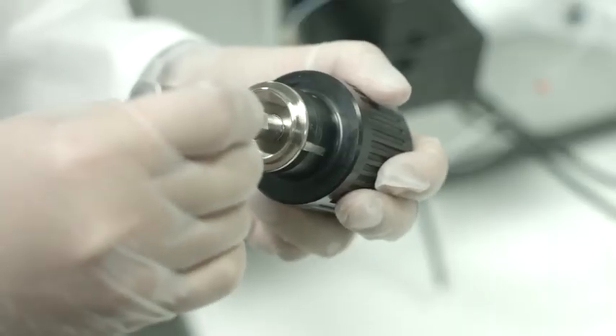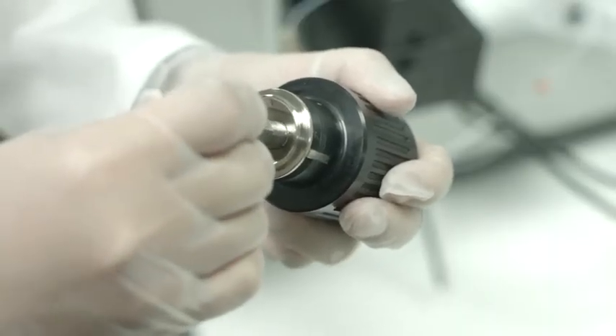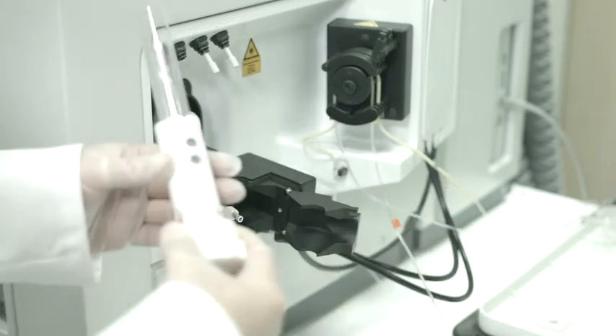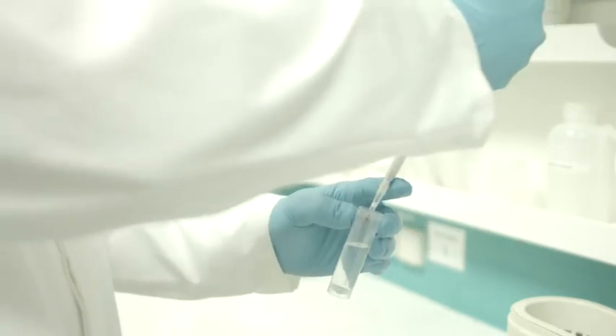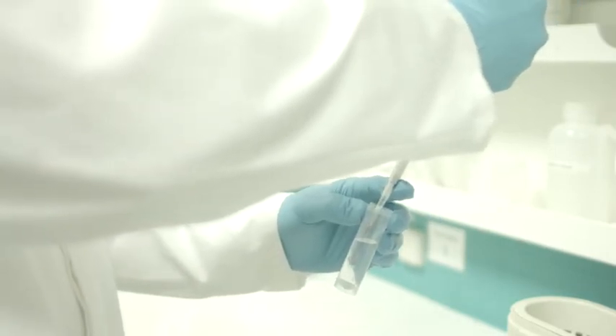One of the limiting factors for ICP-MS is often the ability to tolerate higher amounts of total dissolved solids. The ICAP RQ ICP-MS features easily exchangeable skimmer cone inserts which allow customization of the instrument's characteristics. Other insert types allow increasing the sensitivity even further or increasing the robustness of the system in order to analyze the most challenging sample matrices such as wastewater or soil digests.